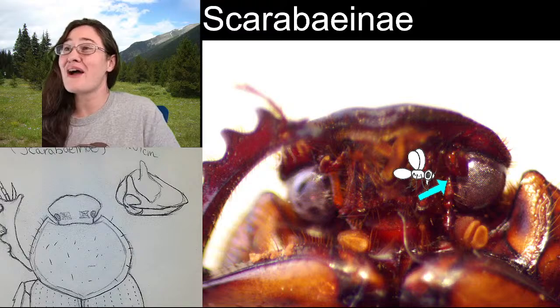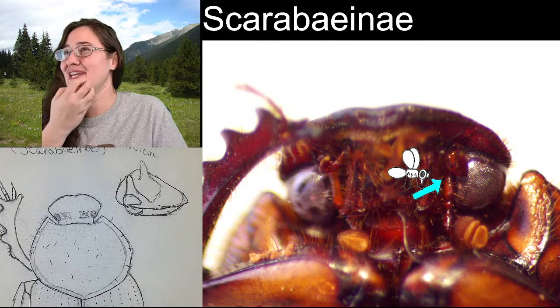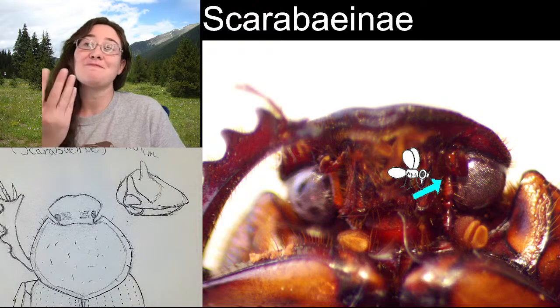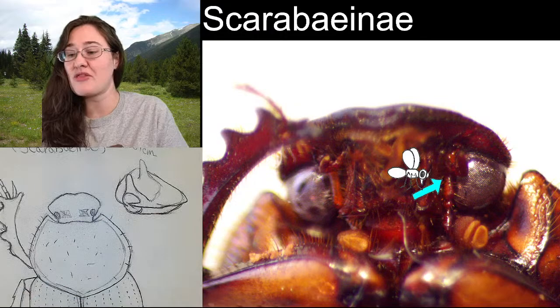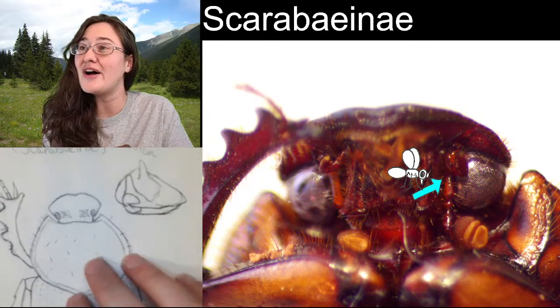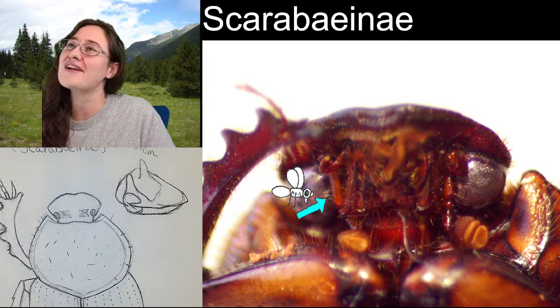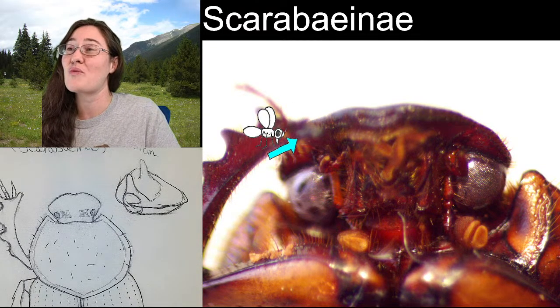So in my head, I feel like you can feel free to argue either way. I'm not sure, but I feel like... and here's the other thing. I'm not sure what type of dung beetle this one is, whether it was a roller or a dweller or a tunneler, but if this one was a roller and it was up in the air, it could in theory use the bottom side of its eyes to watch the ball and the top front of the eyes to watch forward.